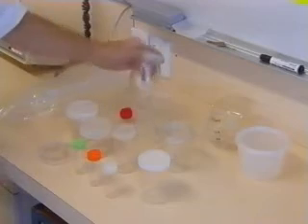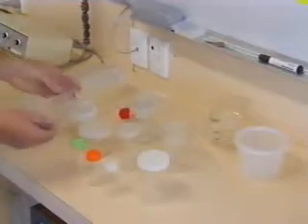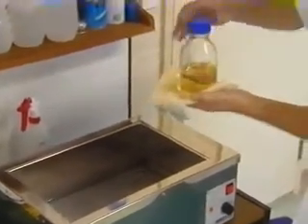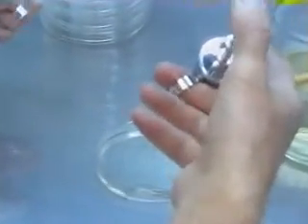There is a wide range of culture vessels: glass jars, plastic ones which are autoclavable, and plastic ones which are not autoclavable and can be purchased in sterile packs. These have been sterilized using radiation. For these ones, media is bulk autoclaved, and then the correct quantity is dispensed into them under sterile conditions.